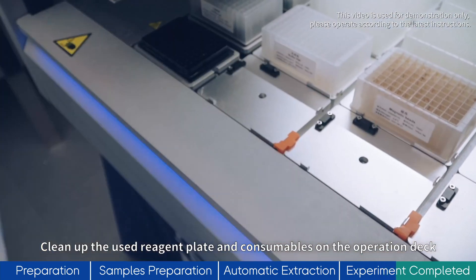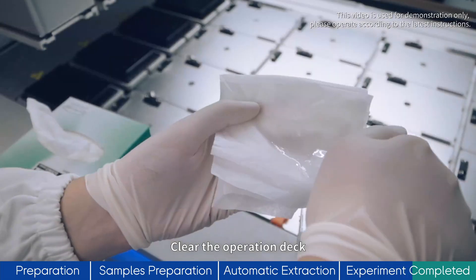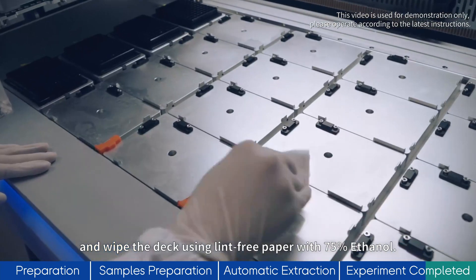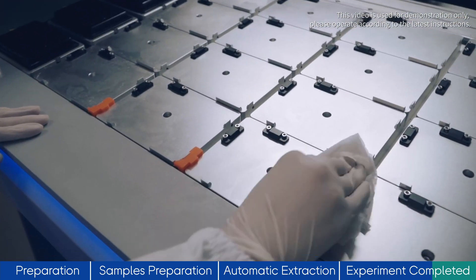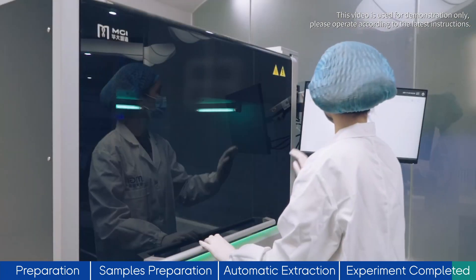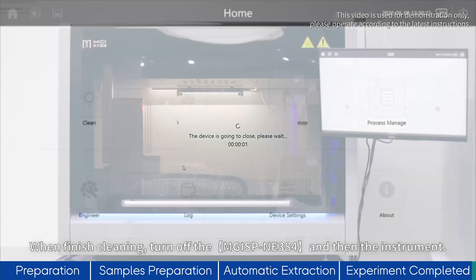Open the left navigation bar and select cleaning. Clear the operation deck and wipe the deck using lint-free paper with 75% ethanol. After wiping, clean it with UV irradiation and air filtration. When finished cleaning, turn off the MGISP NE384 and then the instrument.